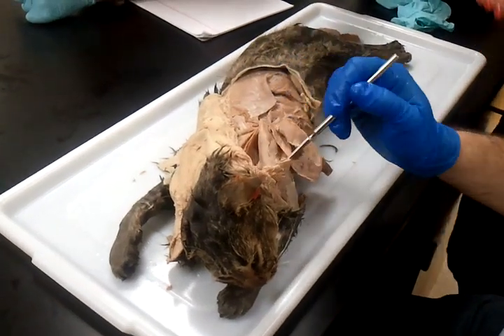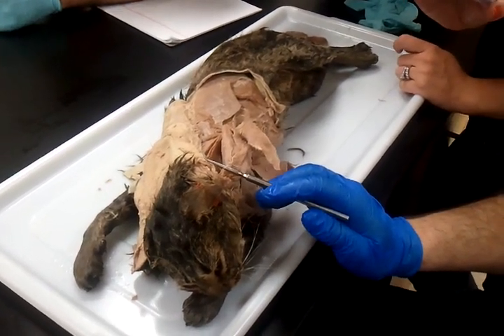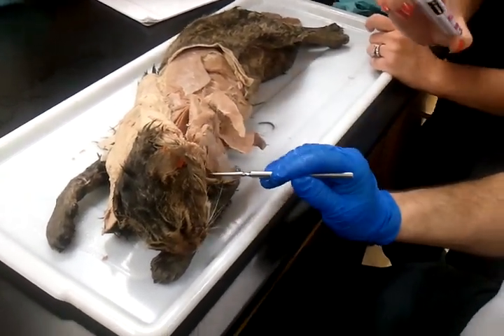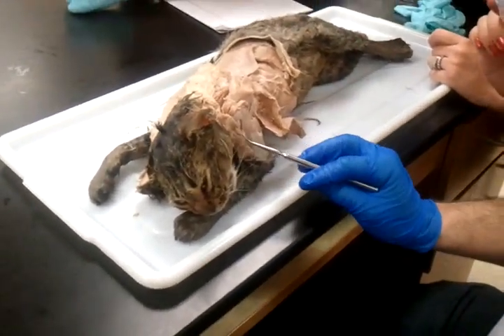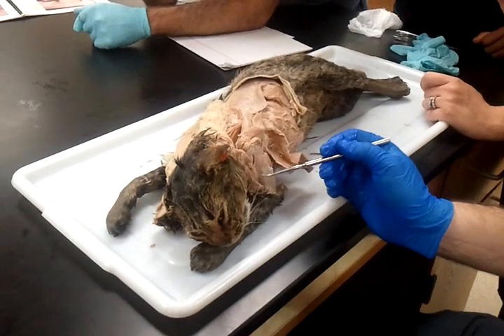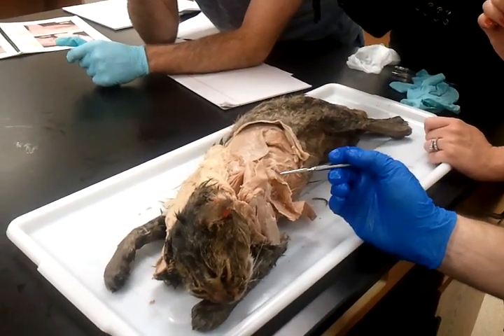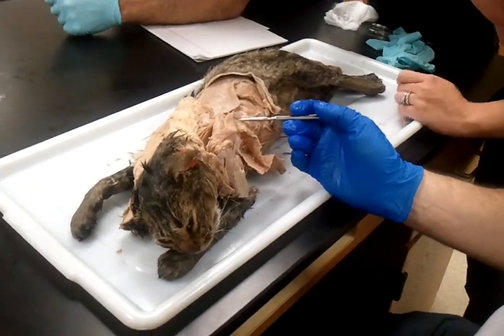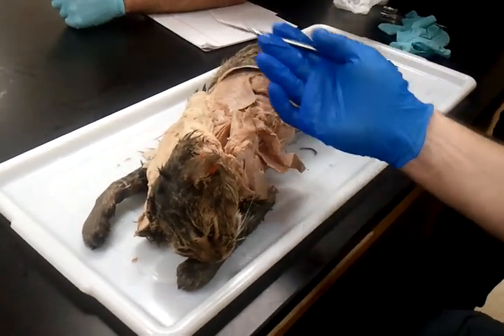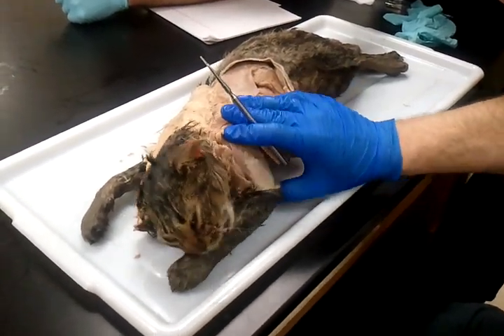Some other structures here that you should be aware of is this white-looking string. That is the spinal accessory nerve. It comes from the brain, goes to the trapezius muscles. And in here, there's another nerve, this white thing right here, and that's called the axillary nerve. In these cats, nerves will look like white string. Arteries will look pink, and veins will look blue. Now, that's in the perfect world. Sometimes the veins may explode during the processing, and there may be blue stuff all over the place. Sometimes the dye doesn't get all the way down to the end of each artery, so it may lose its color. But for the most part, if you look for that, that'll be okay.